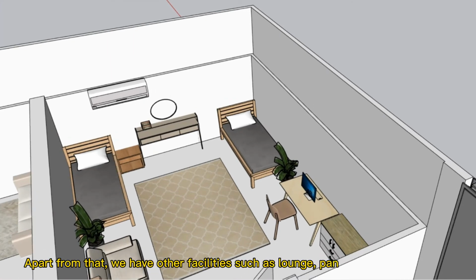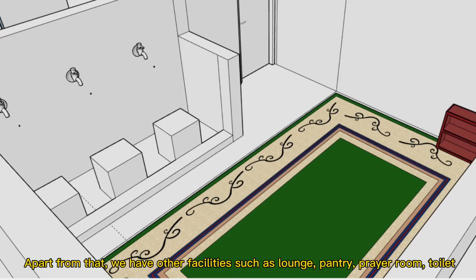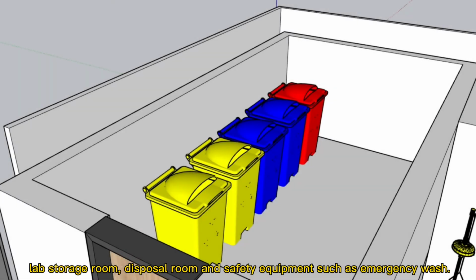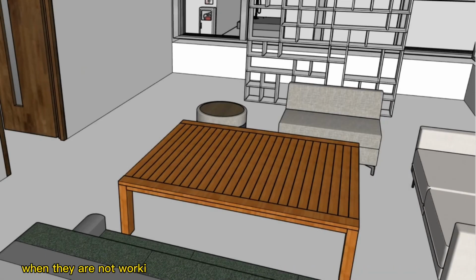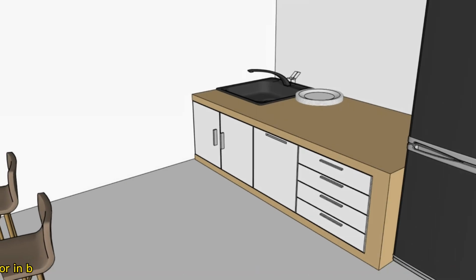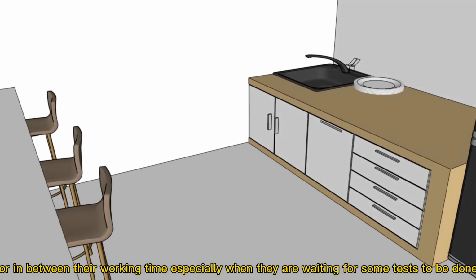Apart from that, we have other facilities such as a lounge, pantry, prayer room, toilet, lab storage room, disposal room, and safety equipment such as an emergency wash. The lounge and pantry area is a place for employees to relax when they are not working or a place for the staff to take a break during lunch hour or in between their working time, especially when they are waiting for some tests to be done.